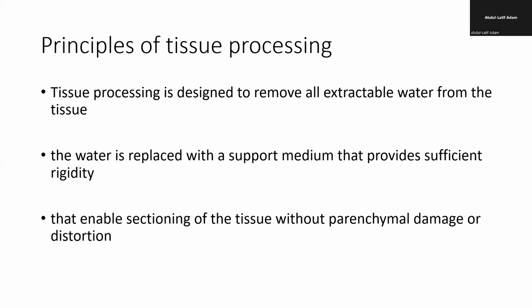The tissue is placed in a supporting medium that will keep it stable and rigid, and this can be kept for as long as the tissue is kept, unless it is exposed to very hot temperatures, or to insects, mice, and all those things that will eat it up.